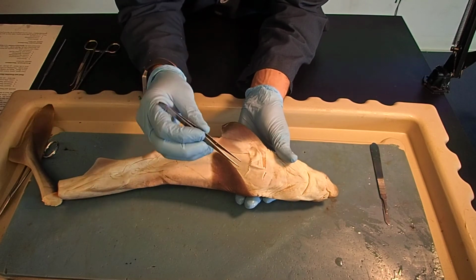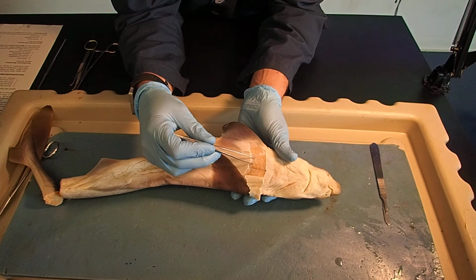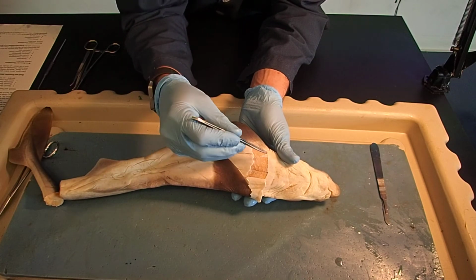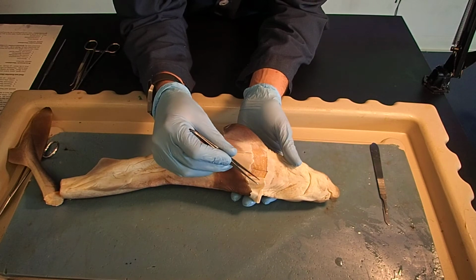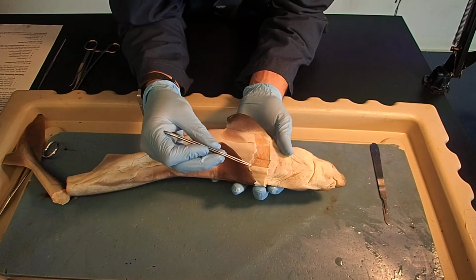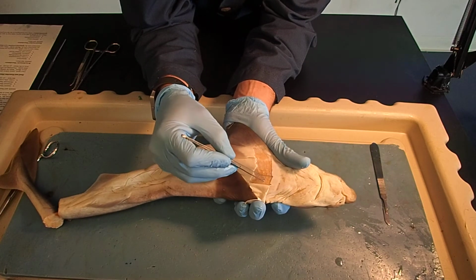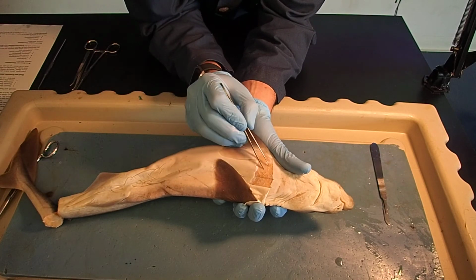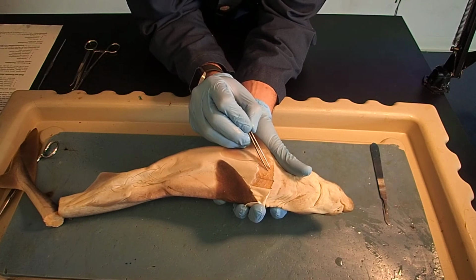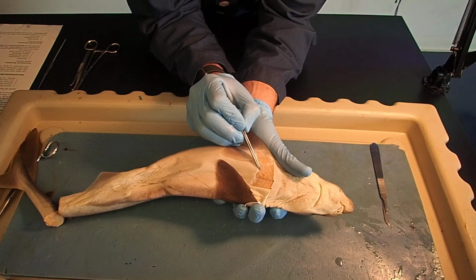Let's look at the ventral side of our shark. Once again, if we move the flap, we're looking at here hypaxial muscle still. We're below, we're ventral to the horizontal septum still. That hypaxial muscle continues onto the ventral side of the shark. This is a good point to show you the difference between myomeres and myoseptum. If you'll notice, on the muscles here, you have these lines that are running between the muscles. You can see them over here as well. In between the lines, you have the muscle itself. Just like we saw with cephalochordata, amphioxus, the muscle itself is referred to as myomeres. The lines in between are the myoseptum.